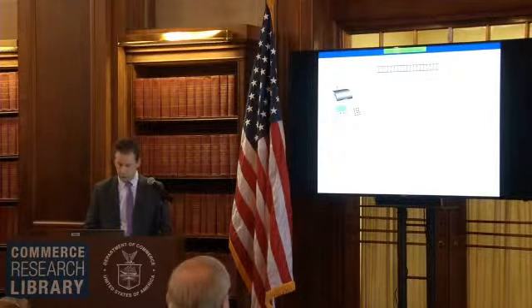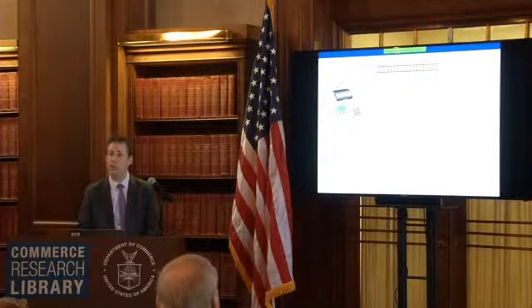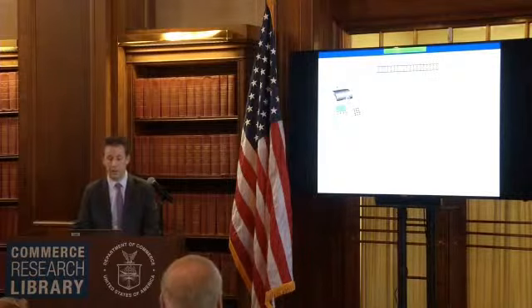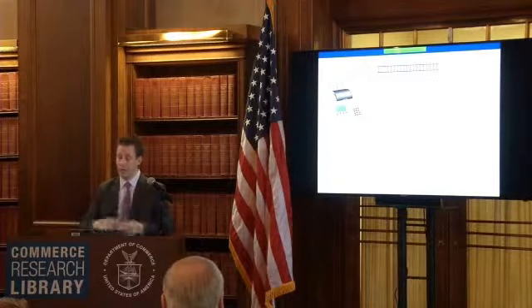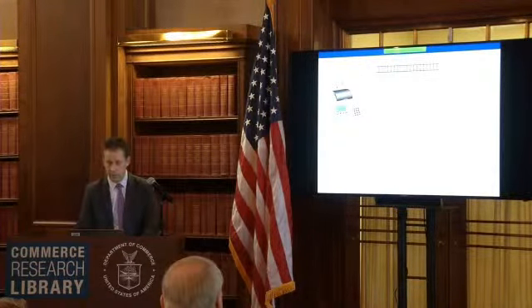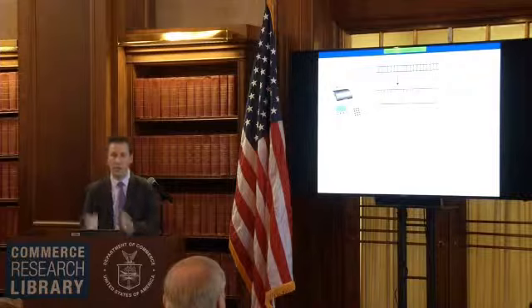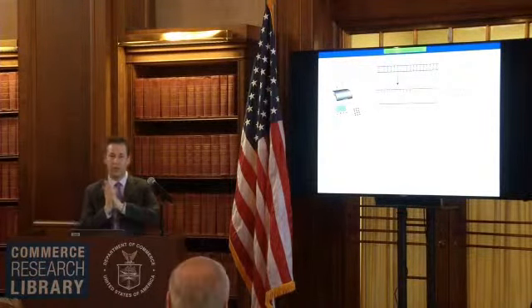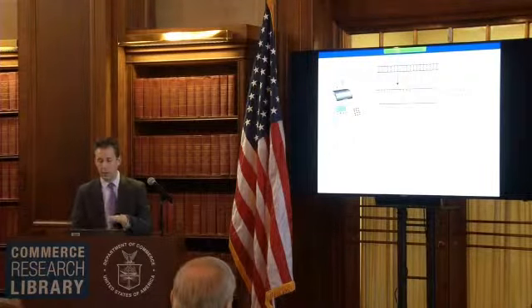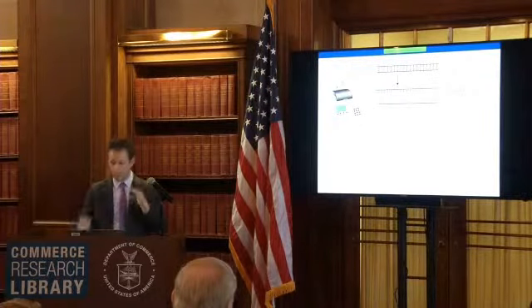The way this works is that this little instrument here is called a thermocycler. All it does is heat and cool. It's kind of like an oven. This would be your tube that has your DNA in it and your chemicals or reagents for PCR. And this would represent a helix right here, your region of DNA. DNA is double-stranded, and if you heat it up, it breaks apart, because it's held together by weak forces. So if you heat it to almost boiling, at 98 degrees C, you have what's called denaturation. The two strands break apart.